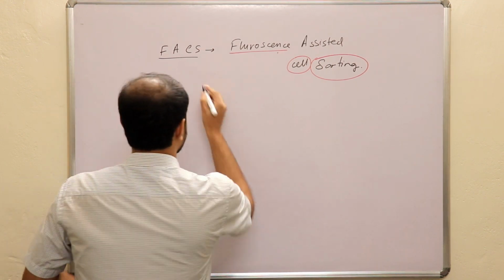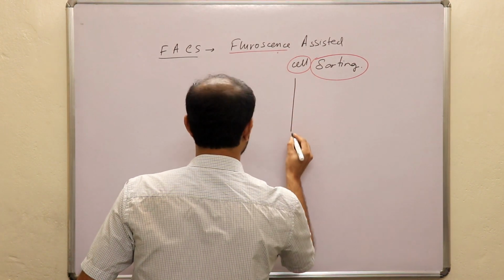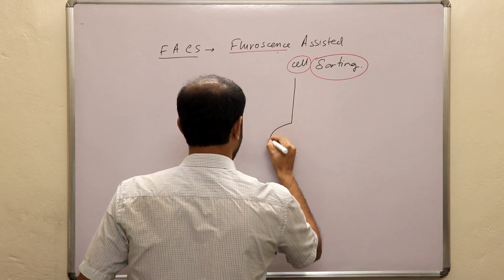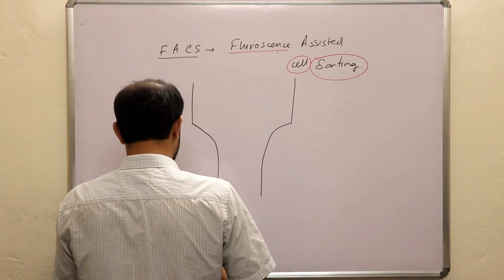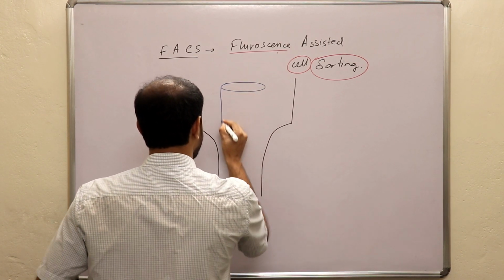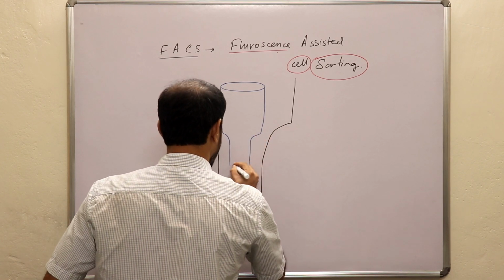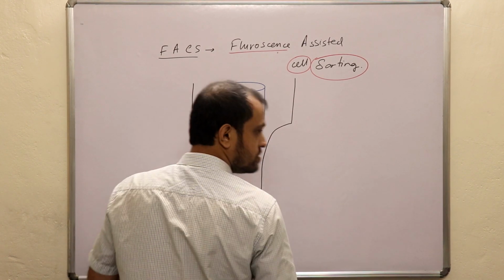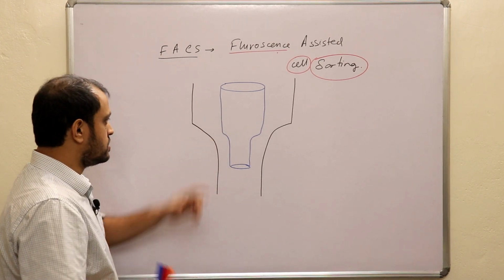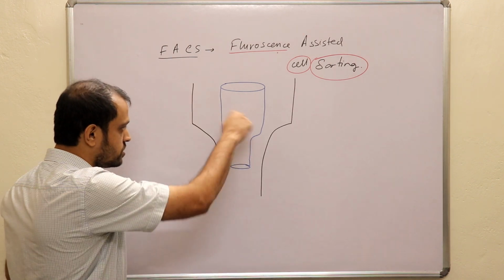Here there is a fluidic system, and this is your chamber where you will have to inject the specimen. This is the tank or the beaker where you will put your specimen.